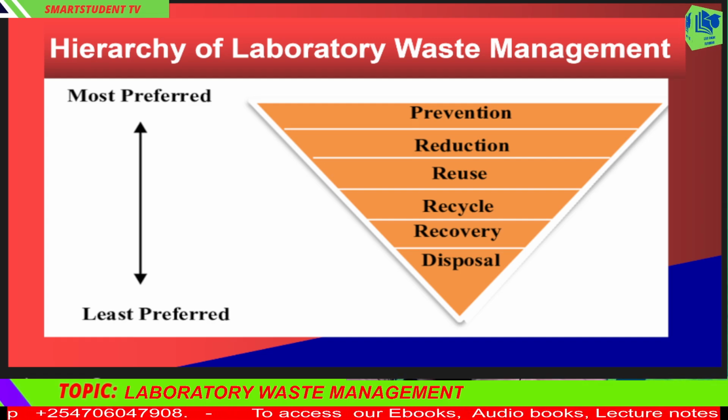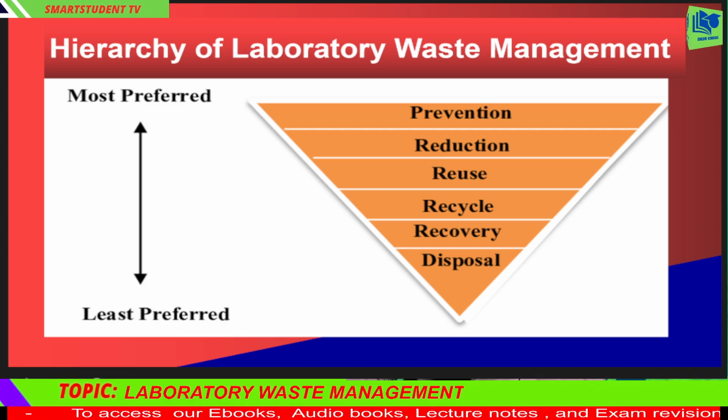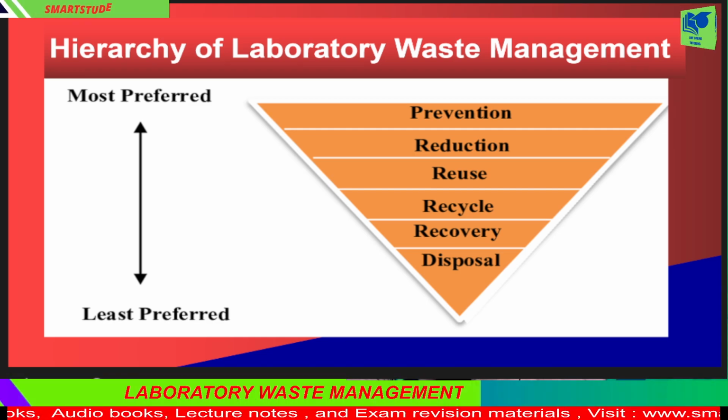Clearly, the best approach to laboratory waste is preventing its generation. Examples include reducing the scale of laboratory operations, reducing the formation of waste during laboratory operations, and substituting non-hazardous or less hazardous chemicals in chemical procedures.